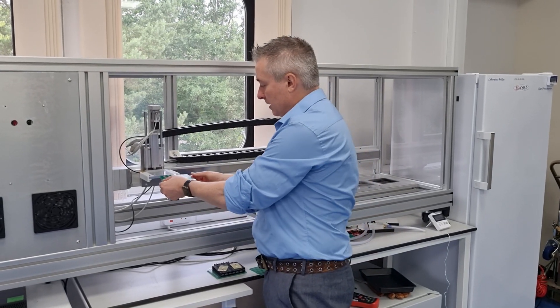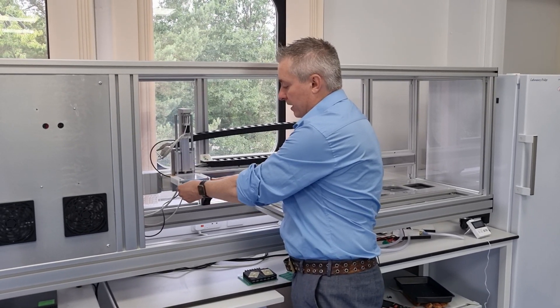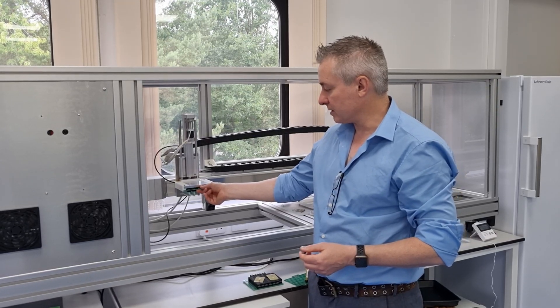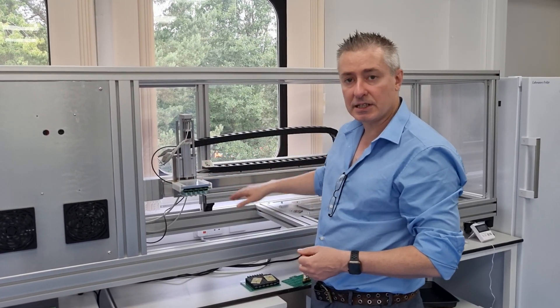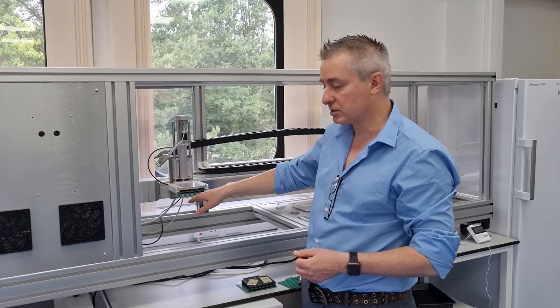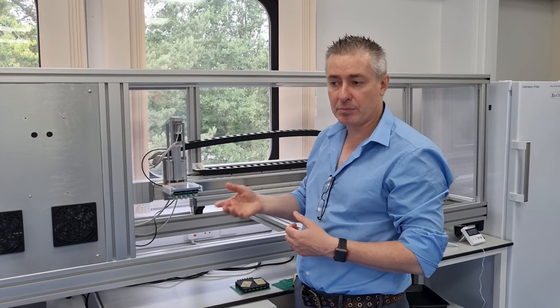We have a robot — we have other videos online about this robot — but what it allows us to do is use this robot, which has X and Z control, to take these screen-printed electrodes and pass them to different baths.